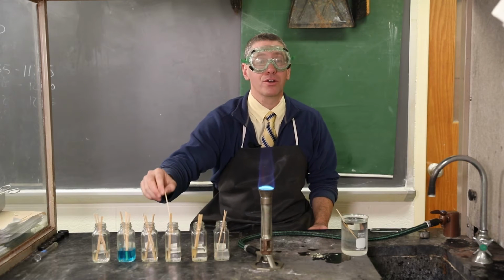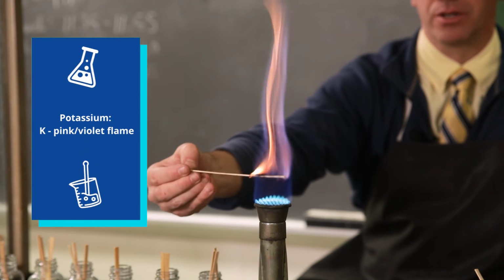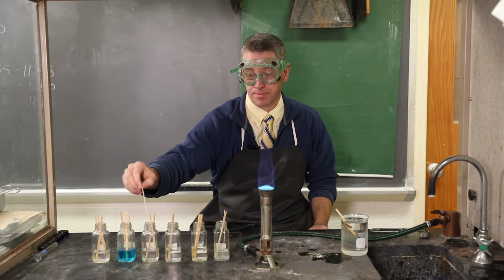The next one's a little harder to see. This is potassium. Can you tell that it's burning kind of a violet color? Once again, the bright color is the stick itself. The next element is strontium.